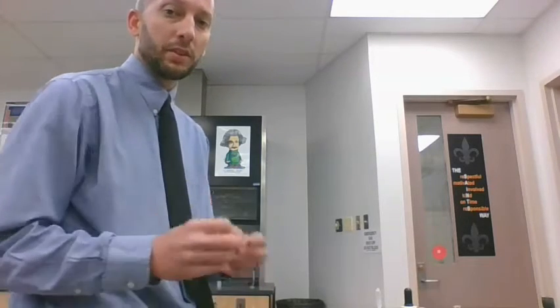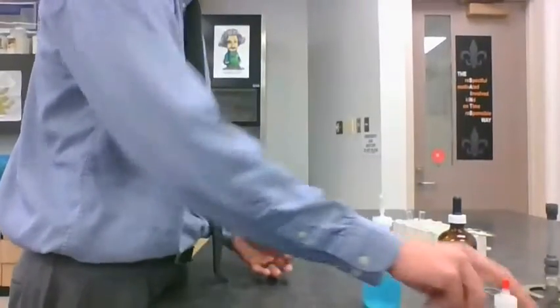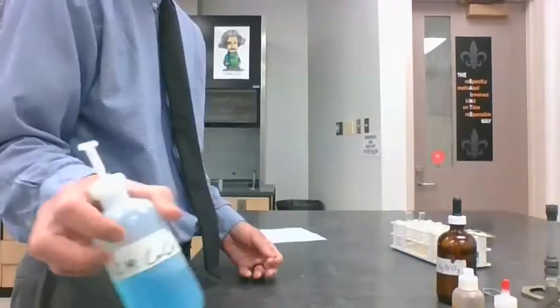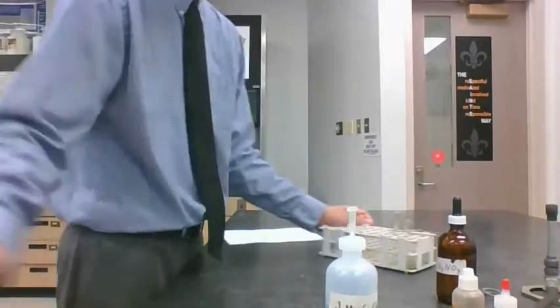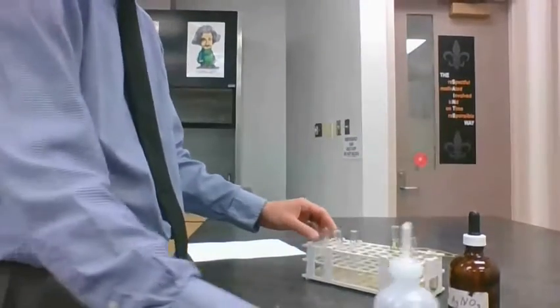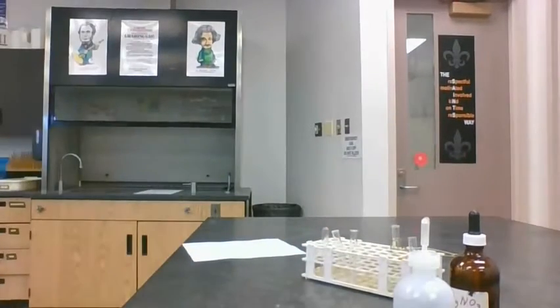Okay, so our first reaction here involves a little strip of magnesium and this blue solution here that's copper chloride. Really all we're going to do with this one is, in a test tube, grab my goggles.